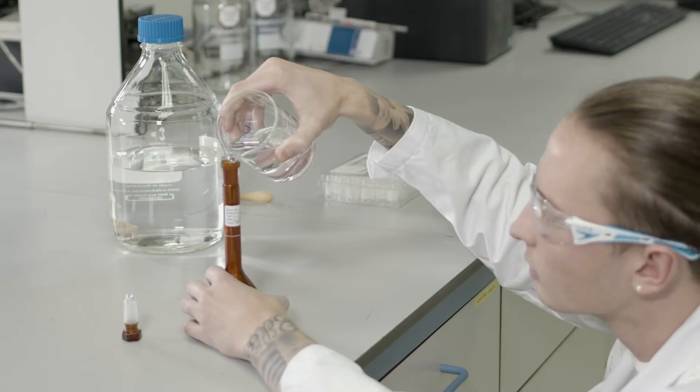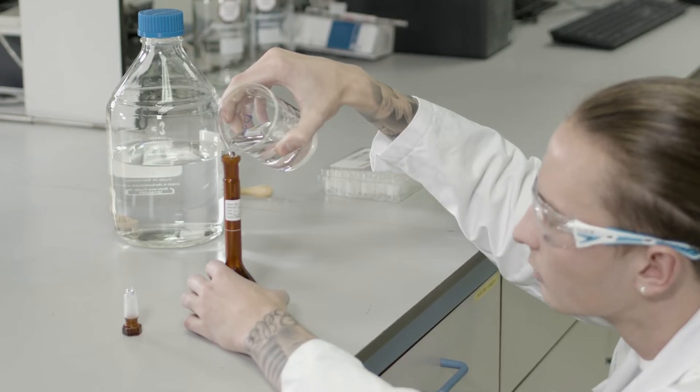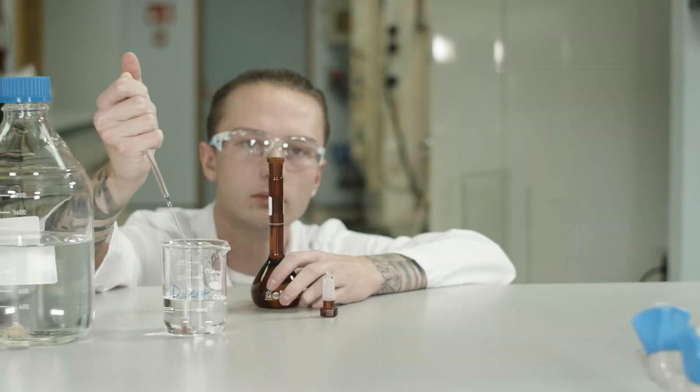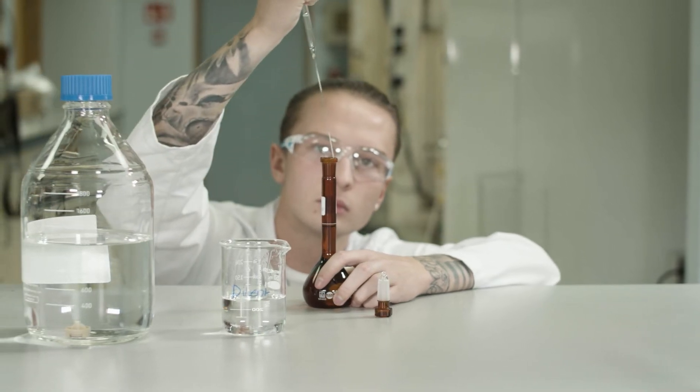If instruments are down, broken, or out of use, then we can't get the analysis done, which means we can't get the products out the door or to the next stage of manufacture.